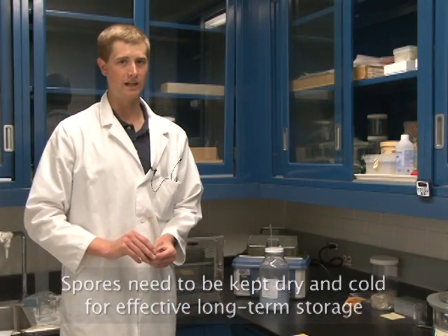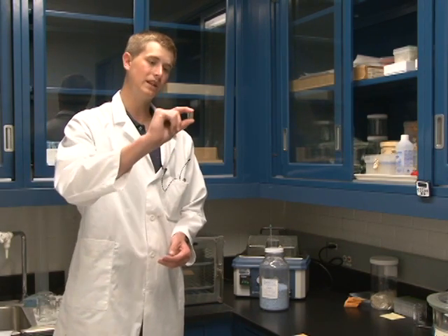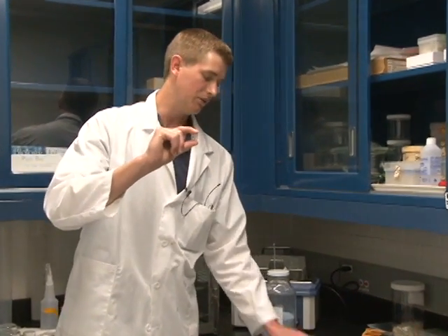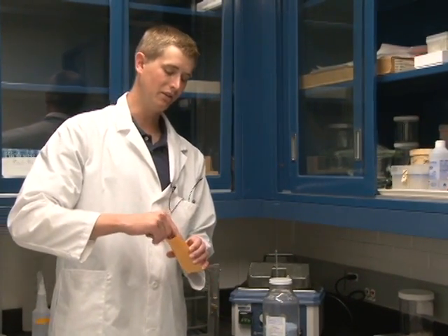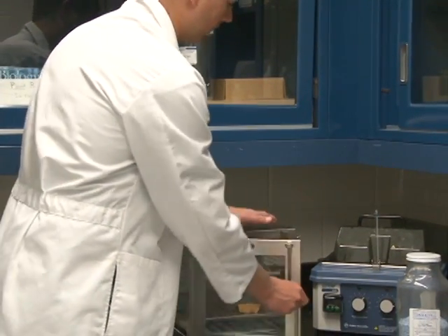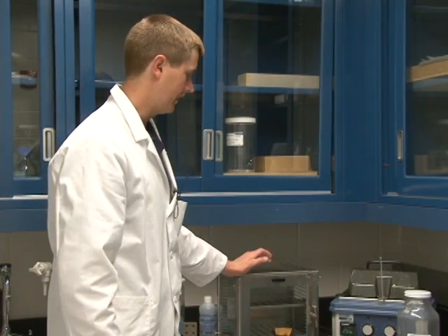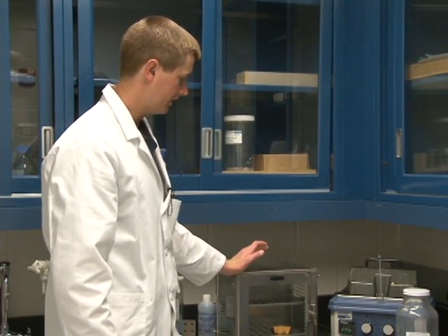In order to keep the spores dry, what we do at the Cereal Disease Laboratory is take spores and place them in a desiccator. We've collected these dry spores into these two capsules here. Take the capsules, place them in an envelope, and place inside a desiccator for three to five days — that will be sufficient to dry out the spores. A desiccator is simply an airtight chamber that has a desiccant inside that dries out the environment inside.